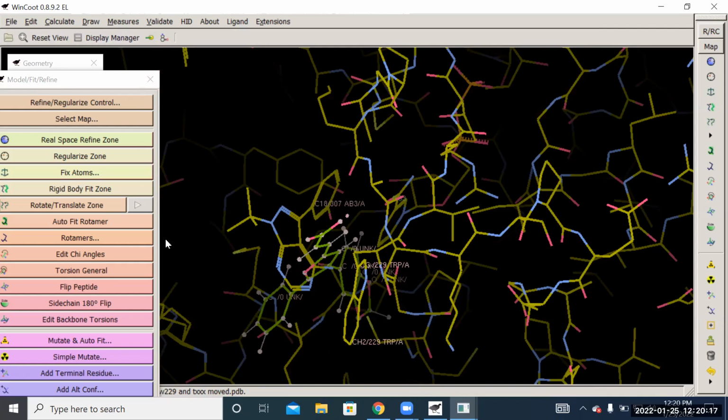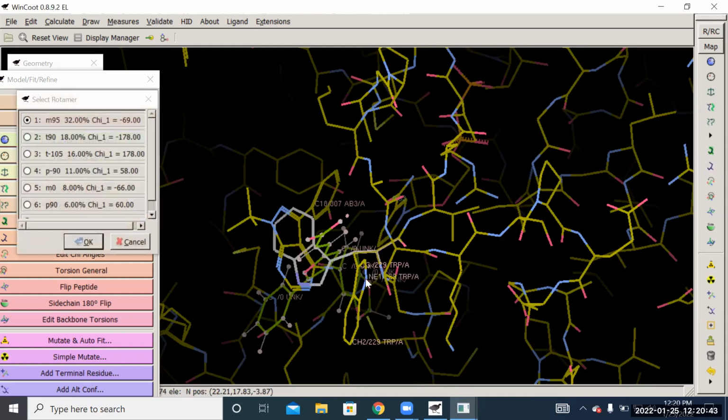Now, I'm not done though, because I've saved the coordinates of the protein and all the new positionings that I have. I did not save the coordinates for this guy, okay? And so, oh, I forgot to tell you, when you're doing the saving of coordinates, when you do rotamers, if you do a rotamer, okay, I'm going to double click on this one again. It tells you which you'll click until you find the rotamer that matches up.